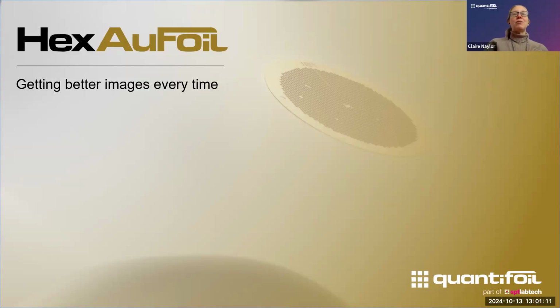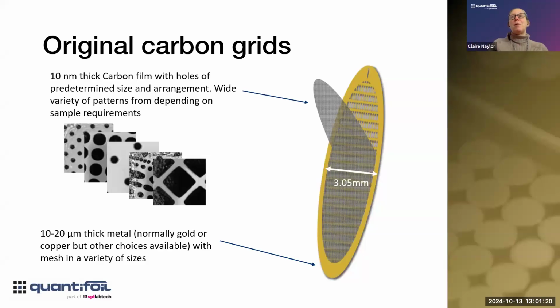So today I'm going to quickly run through a little intro about the HexAuFoil grids. But first, perhaps appropriately, because I'm the first speaker, a little bit of history.